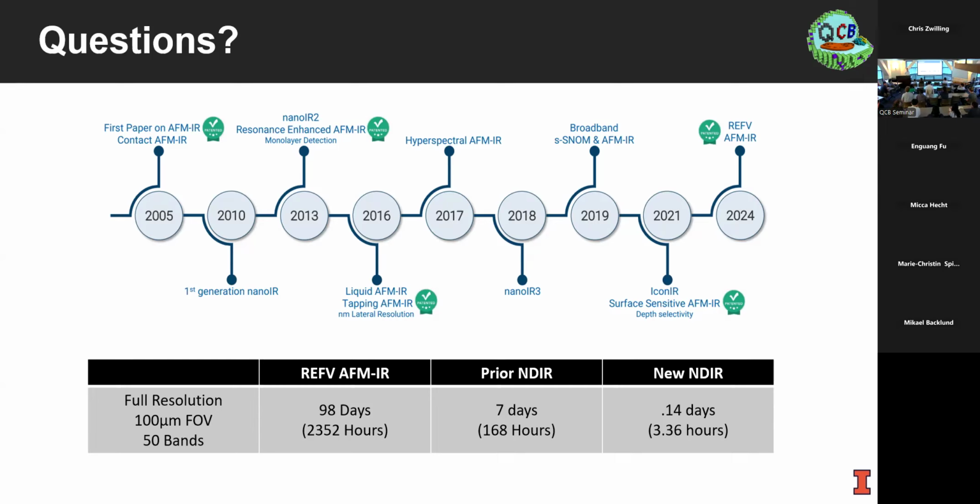I mean, the bottom line is the time that you have now is really down to 3 hours. Right now I just pick random parameters. Don't be too honest. I mean, let's say this data set, whatever I defined here, takes us 3 hours. It would take them 98 days. Like, I'm wanting to make a figure like this for an actual data set.